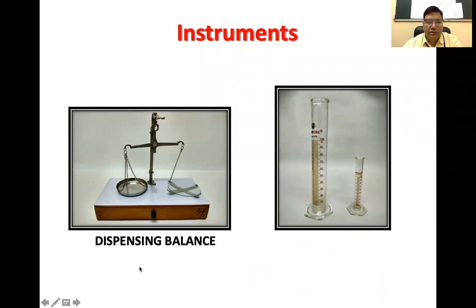Which you are going to weigh, because this is not sticky and does not react with the substances. On the right side, that photograph depicts the measuring cylinders. So two cylinders are there. One is of 100 ml. The other measuring cylinder is of 10 ml.